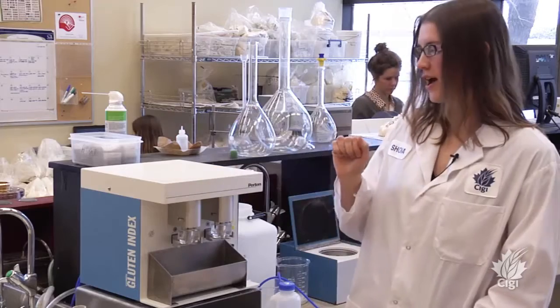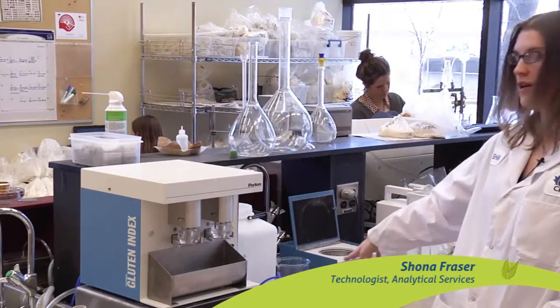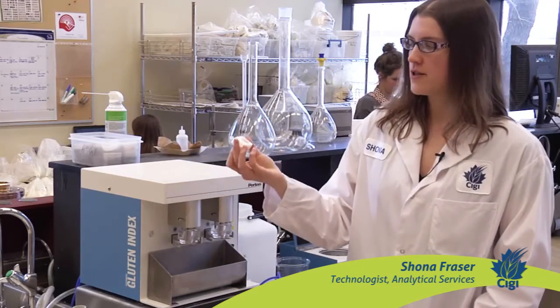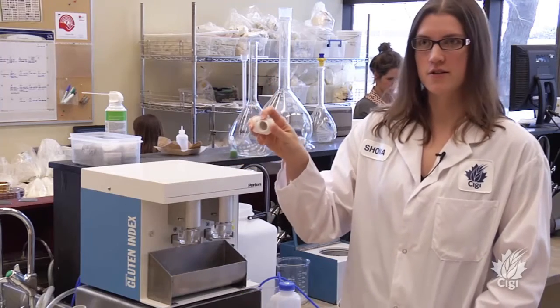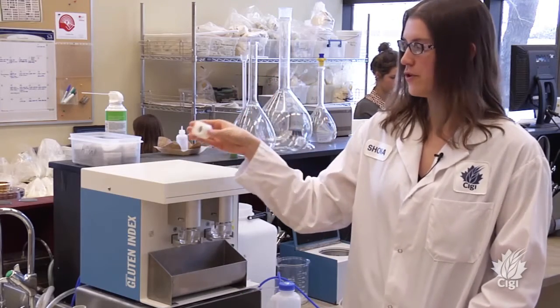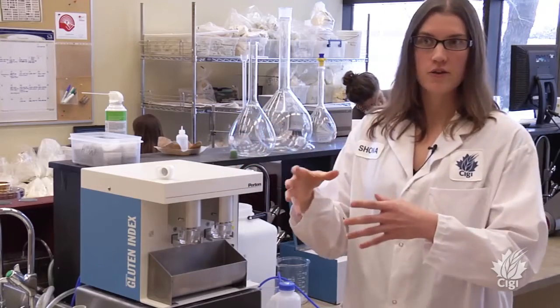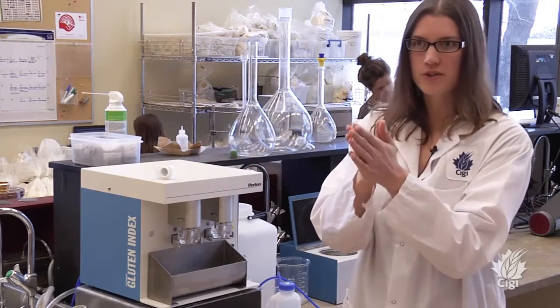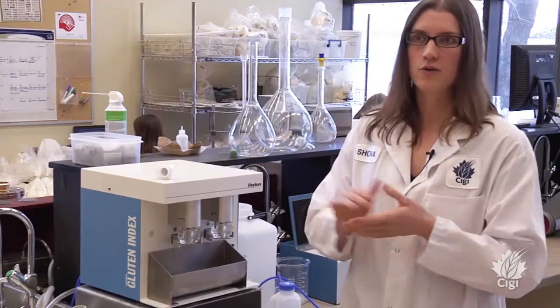This is the glutamatic. When we do the gluten index, we're also using the centrifuge over here. We're weighing the amount of gluten that passes through on the back side versus the amount that stays on the initial side after it's been centrifuged. The more that passes through, the weaker that gluten tends to be — more stretchy. Whereas a very strong gluten would stay on the initial side of that cartridge, giving us an idea of the quality of the gluten.